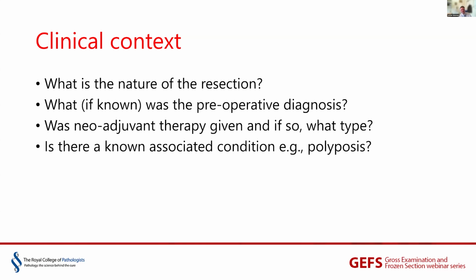There might not have been, of course, if the specimen was taken because of an emergency, such as obstruction or perforation, but very often there will be preoperative biopsies. They're particularly useful if, of course, looking at the third bullet point, neoadjuvant therapy was given. There might be a striking response, there might be no response to neoadjuvant therapy, but if there's a striking response, the preoperative biopsy might be all that you've got to work on in terms of the tumour type, etc. Yes, was neoadjuvant therapy given? We're not always told that, are we?